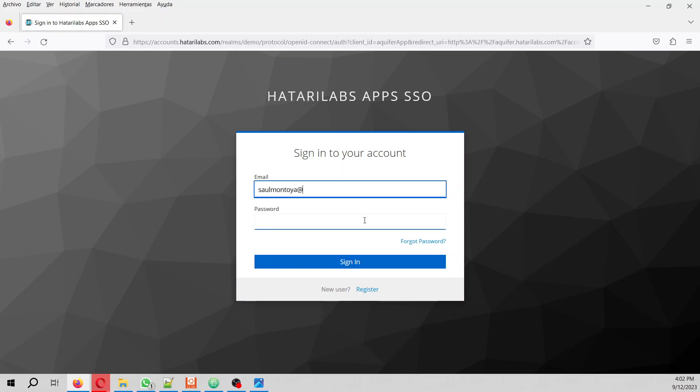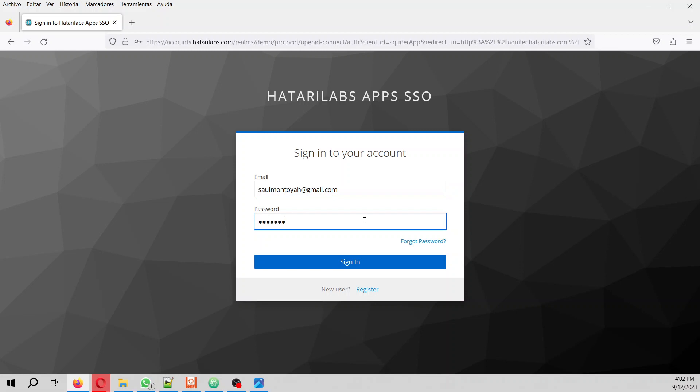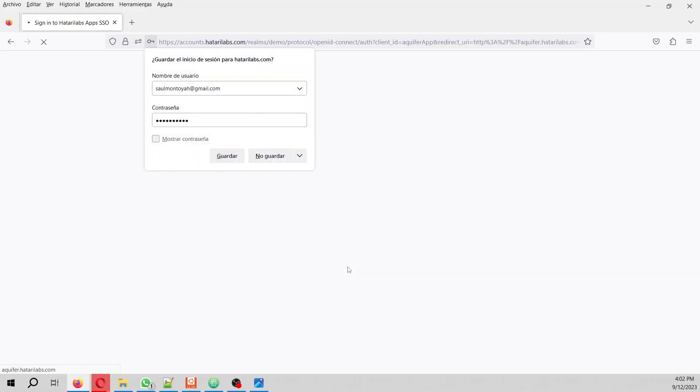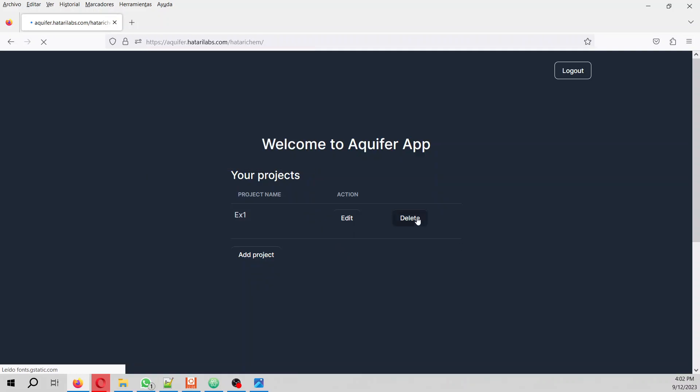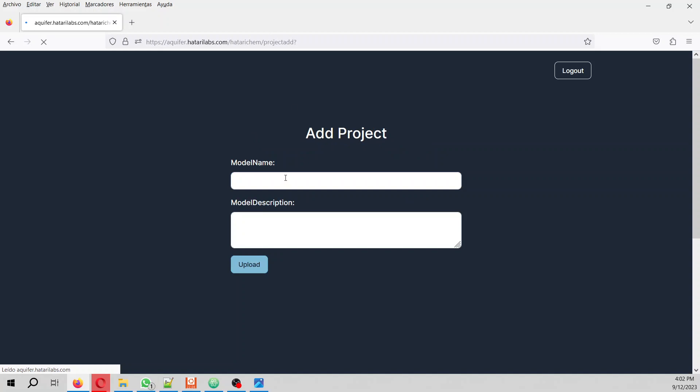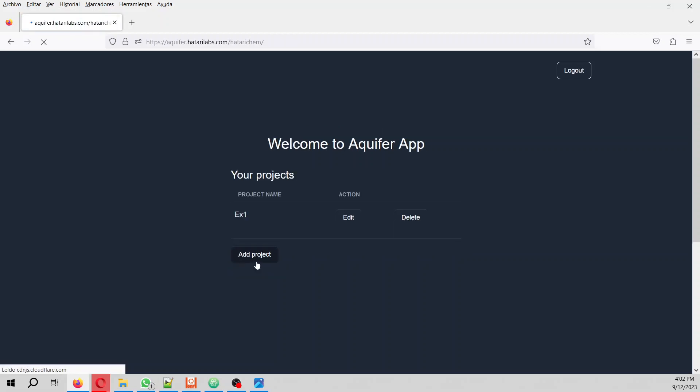You can create one project entirely free. So we create a project - this will be EX1 and this is an example.